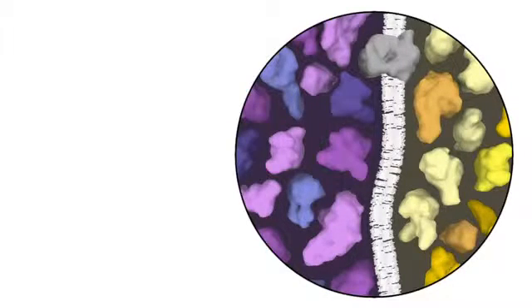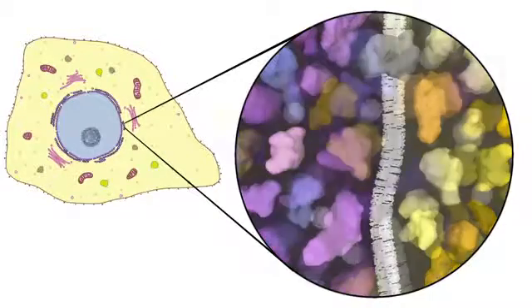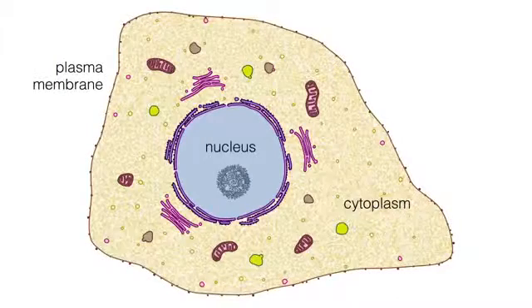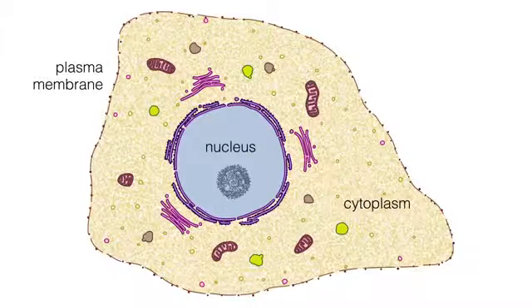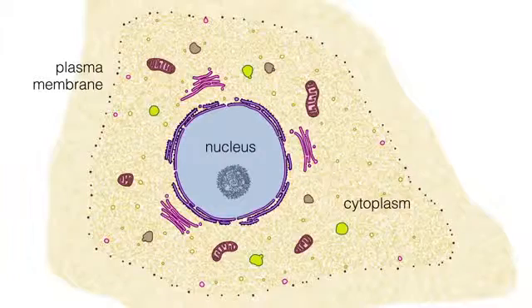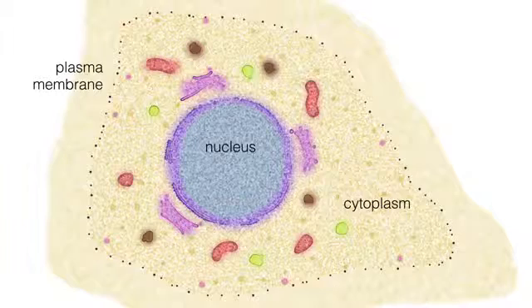In the Western blotting procedure, proteins are first isolated from the rest of the cell's components. To extract proteins from cells, researchers use chemical-based and/or physical-based methods to disrupt the cell's plasma membrane and release the proteins inside it. Chemical-based lysis uses various types of detergents to make proteins accessible. For example, weak detergents are used to extract water-soluble proteins inside the cell without disrupting intracellular membrane compartments. Strong detergents are able to solubilize, or make available, the proteins found within all membranes.